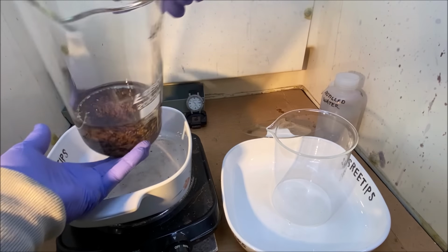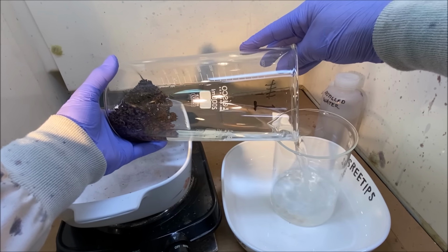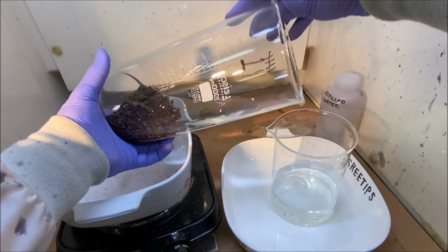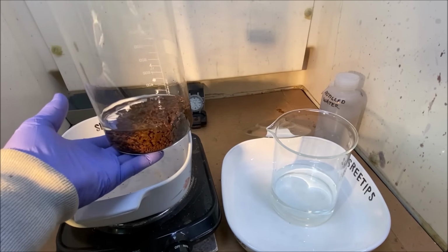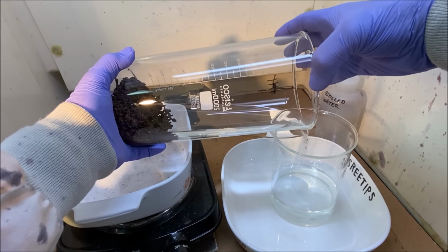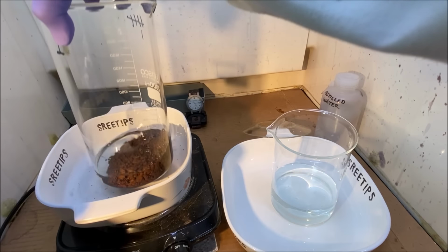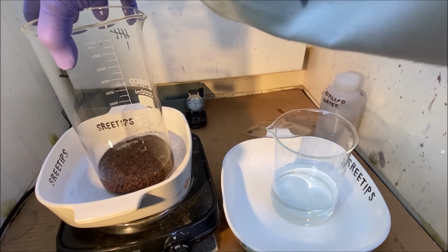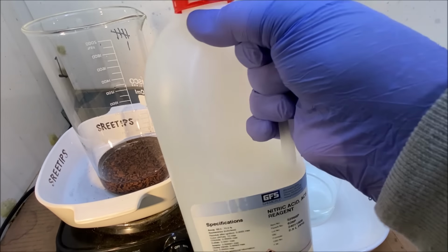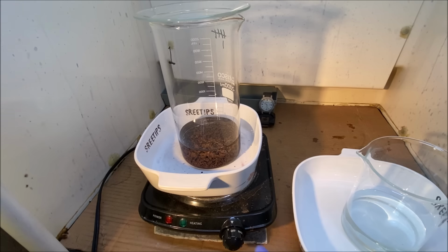Dump most of this water off out of here, and something inside is saying I need to do just one more nitric boil just to make sure. Because we only did like what, six on each of these containers. Adding some heat. And what we'll do is give this a boil.